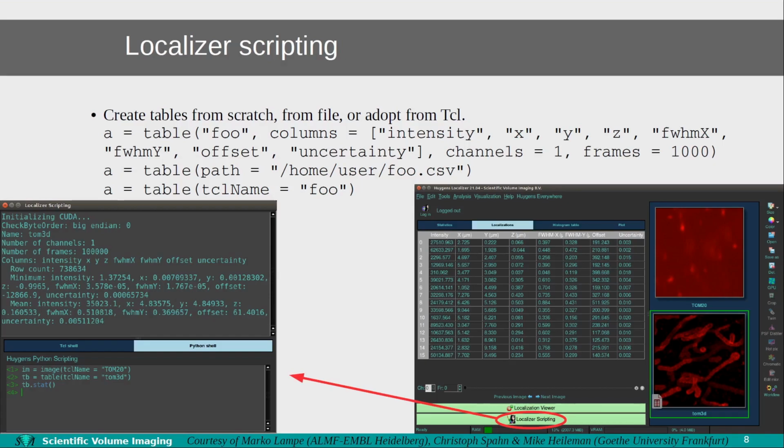So what that means is that you have an image with spots which are turning on and off, and these will be single fluorescing molecules, and by recording a time series of these flickering molecules, you can determine the position of each of these molecules and use that to generate an image with a much higher resolution than you would get with regular optical microscopy.